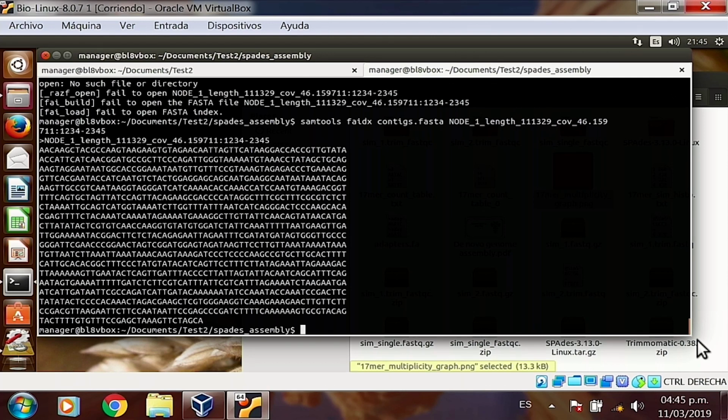to finish, right? But I'll quickly talk about what validation means and what are the three main types of validations that we need to look into.